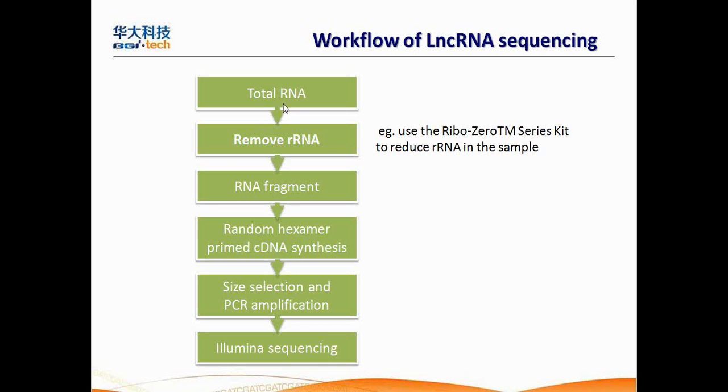That's why this method allows us to sequence the messenger RNA and also the long non-coding RNA, because we only remove the ribosome RNA here.